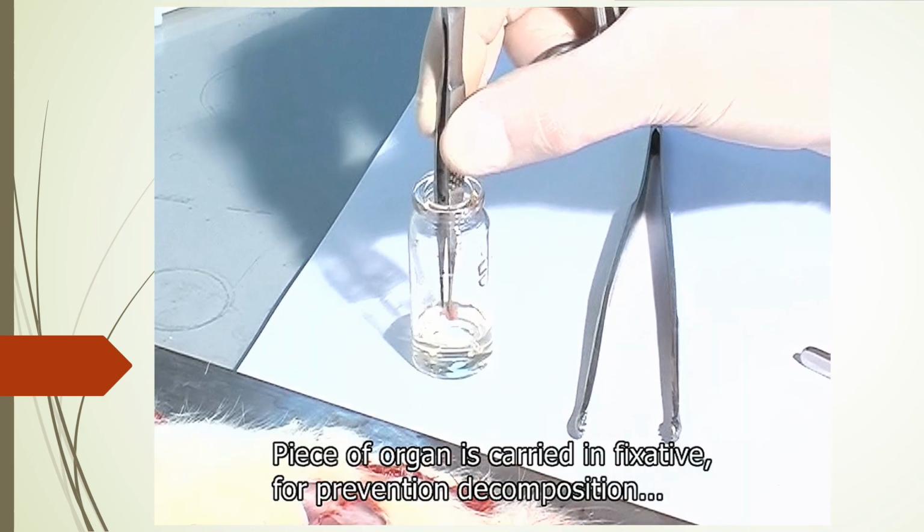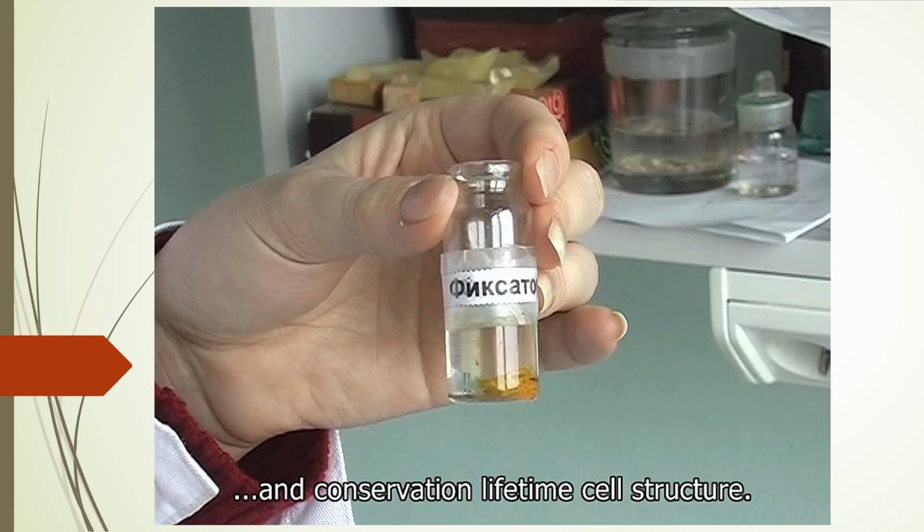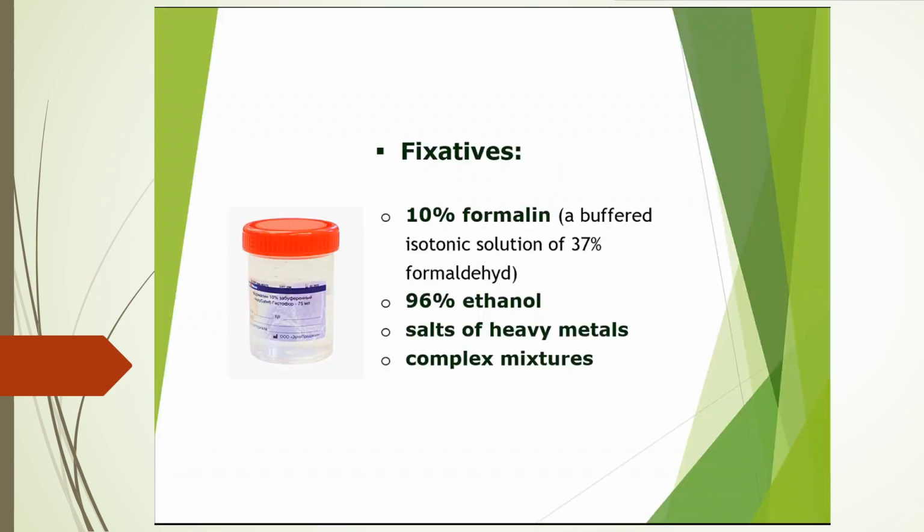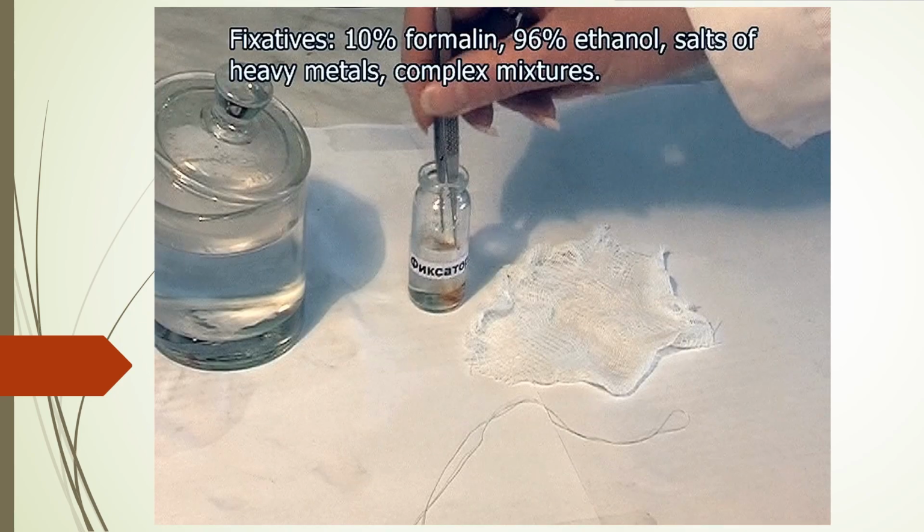A piece of the organ is placed in fixative, for prevention of decomposition and conservation of the lifetime cell structure. Fixatives include 10% formalin, 96% ethanol, salts of heavy metals, and complex mixtures.